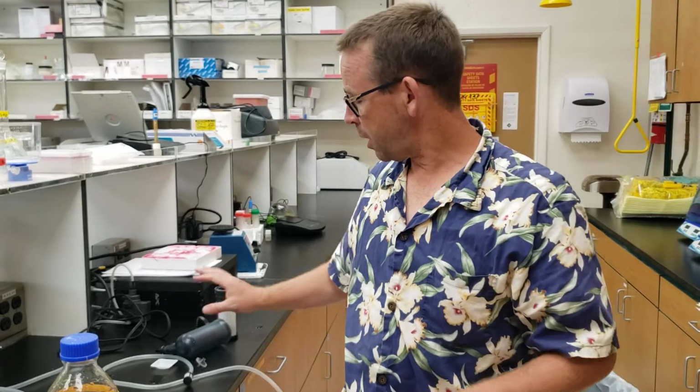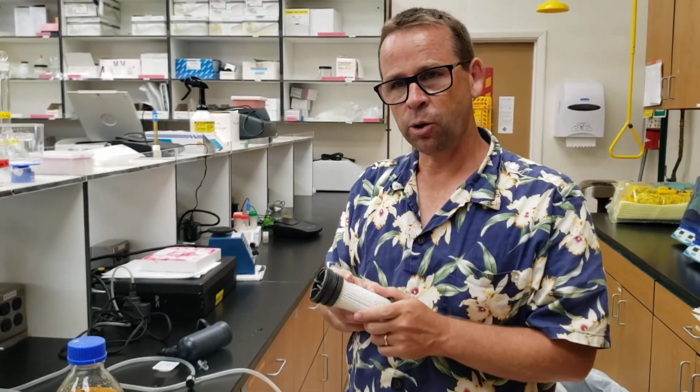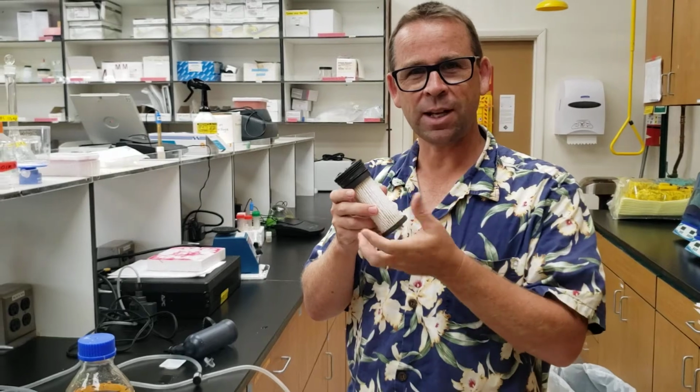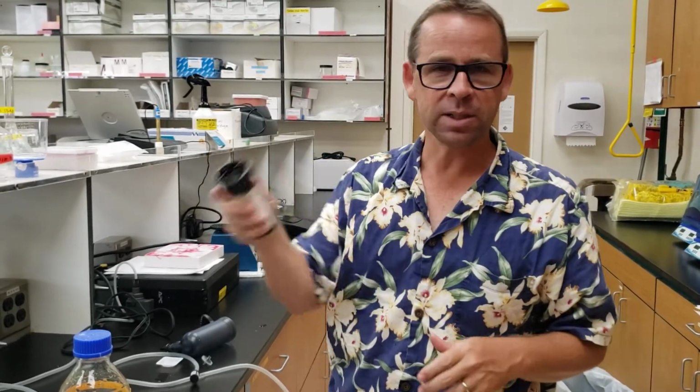We did monitor the conductivity of the EDTA before we bound it to the activated carbon in here, and afterwards. Unfortunately, like before, when we deal with these types of filters, there's always some saturation and some water that remains in here. You can't always get it out.